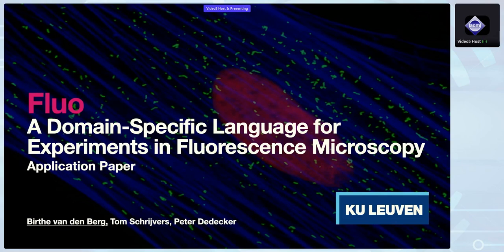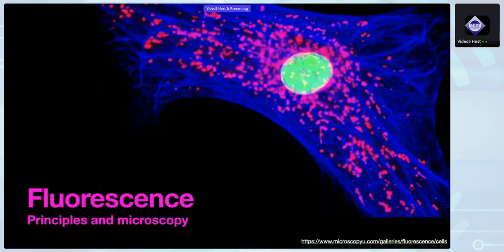So today I'll present to you a nice and perhaps unexpected application of domain-specific languages, namely in the domain of fluorescence microscopy. So let me first walk you through the application, the principles of fluorescence, and what fluorescence microscopy actually is.